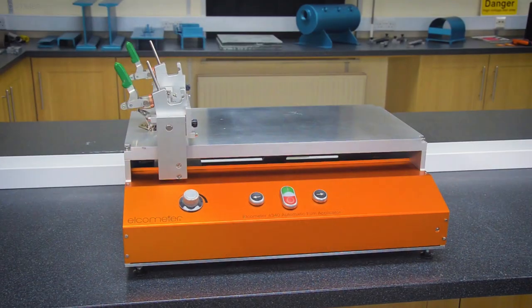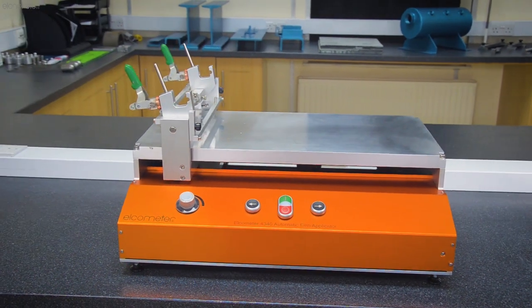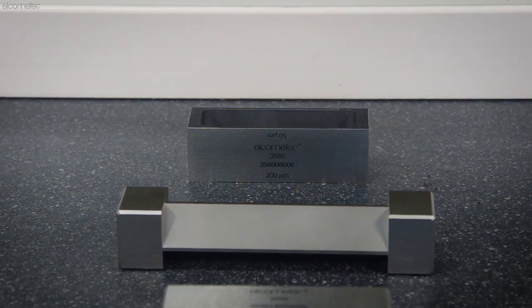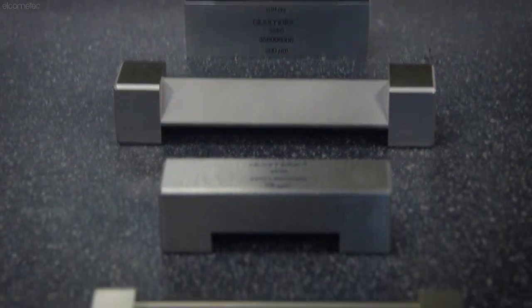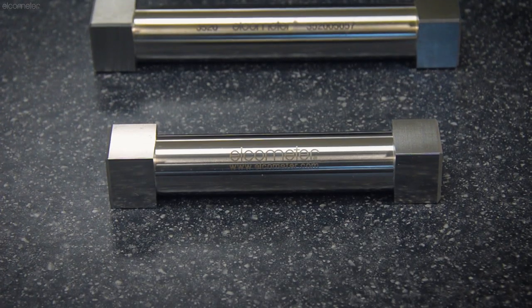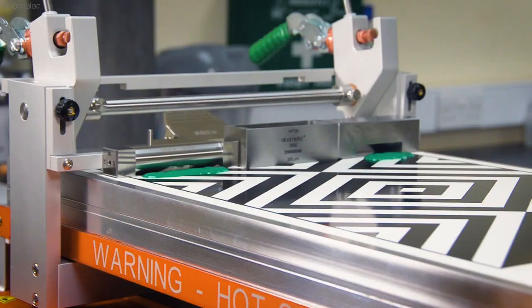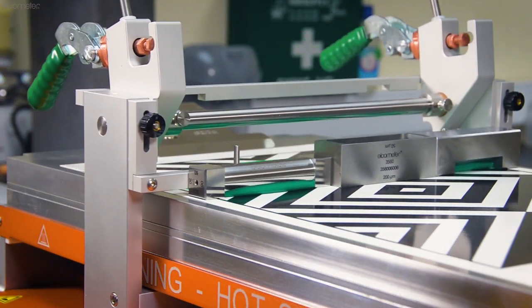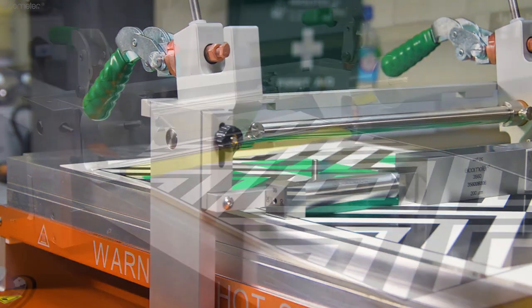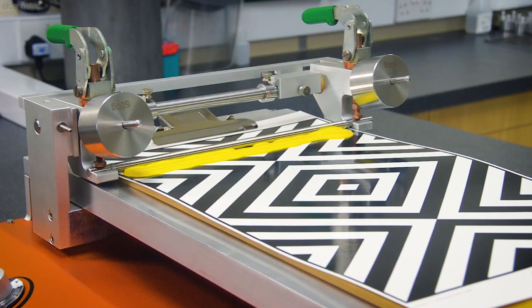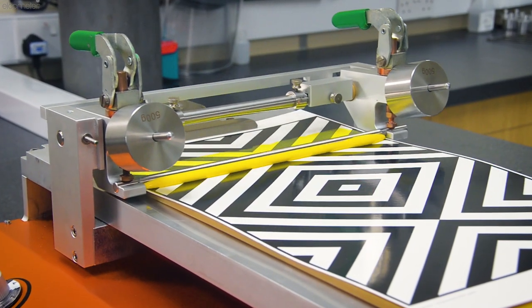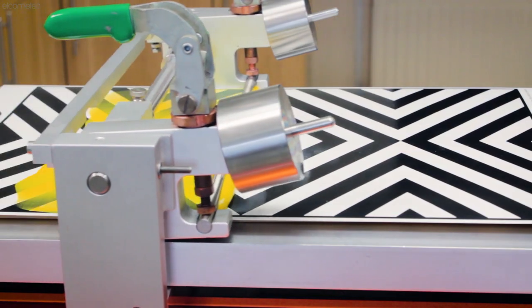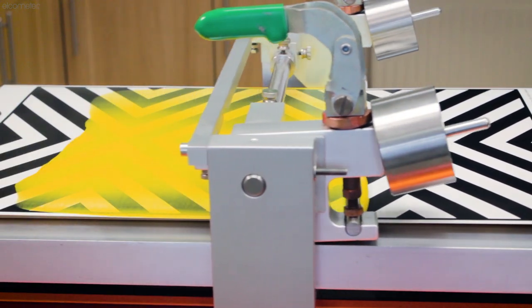In this video we're going to show you how to create a film using a film applicator with the Elcometer 4340. While there are a wide range of film applicators available with varying designs, they all work in much the same way. Alternatively, if you want to find out how to create a film using a spiral barcoder with the Elcometer 4340, make sure you check out our separate how-to video on that.